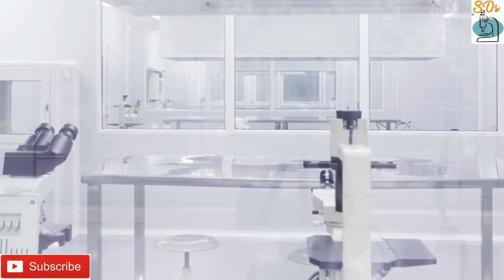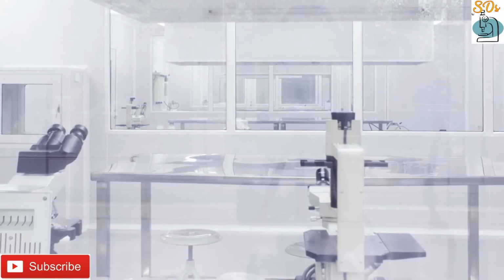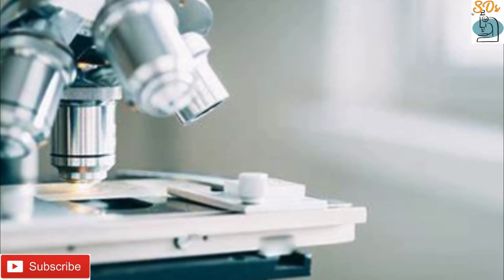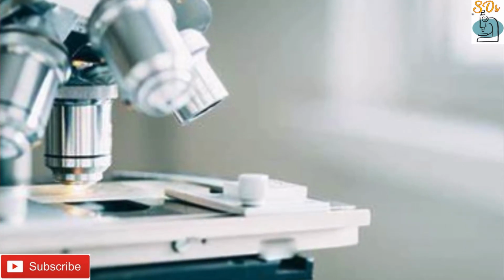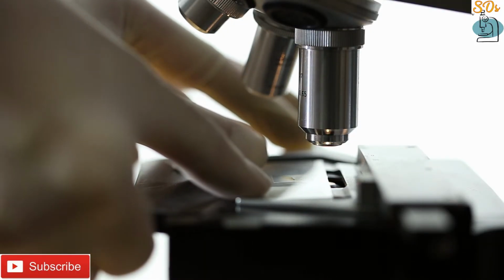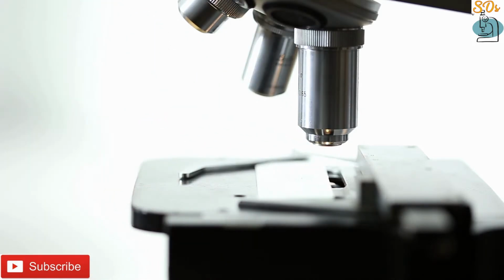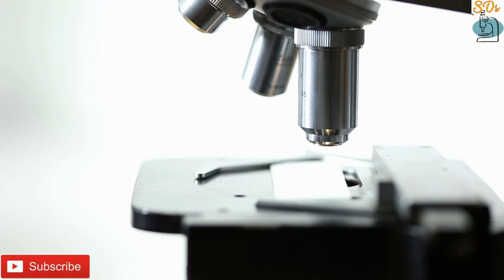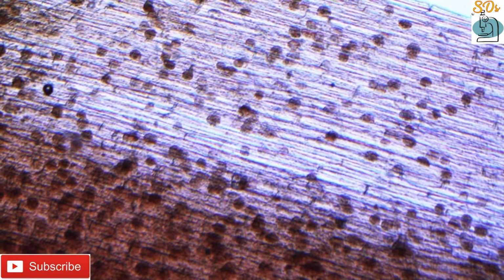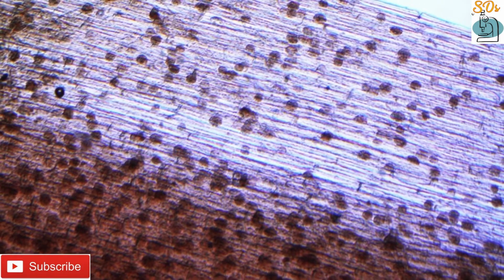So let's place the slide over my compound microscope, setting it first for 10x objective. Yes, got it. First phase is prophase. I got two types of prophase phase. One is early prophase phase and another is late prophase phase.